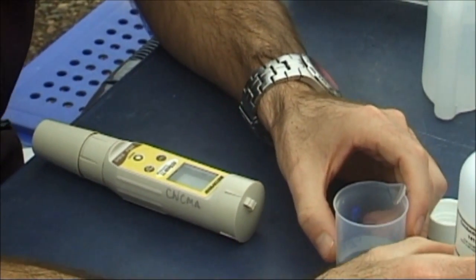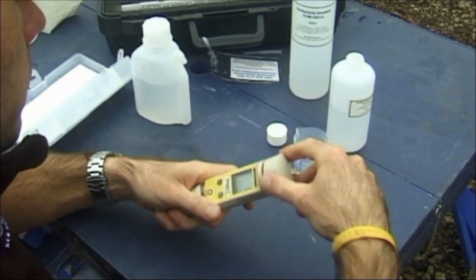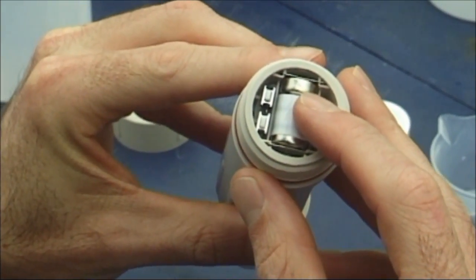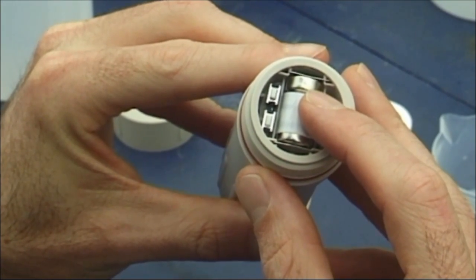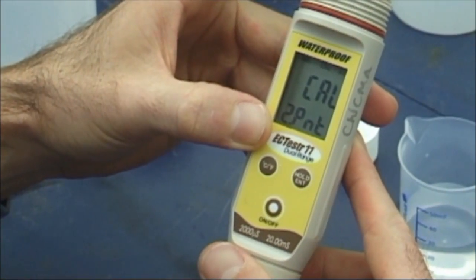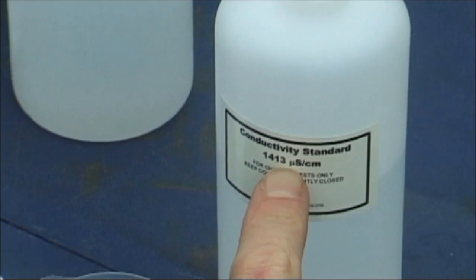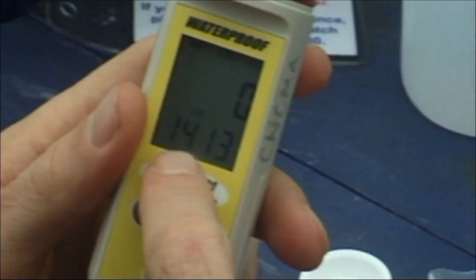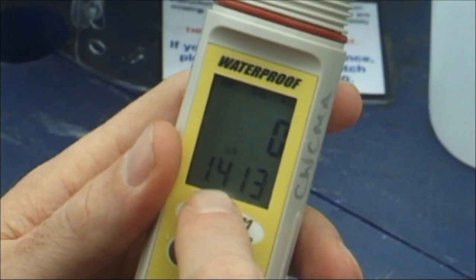Switch the probe on and undo the cap. Look for the white buttons. Press one of the buttons to activate the calibration mode. Check the screen says CAL and is flicking between the 1413 microsiemens and 12.88 millisiemens measurements.